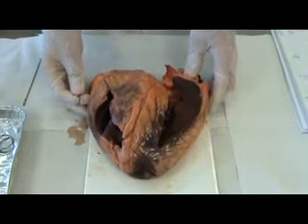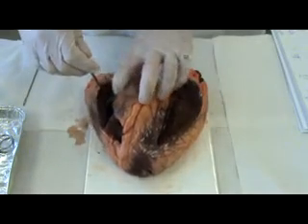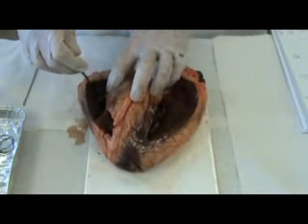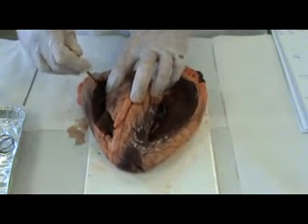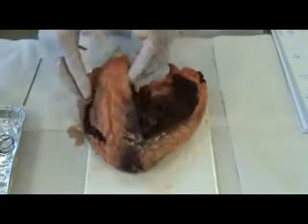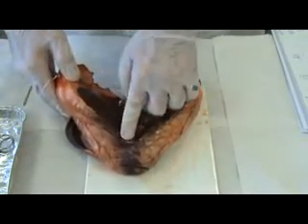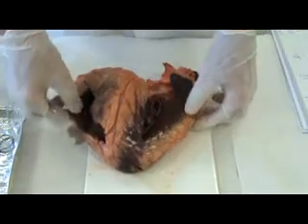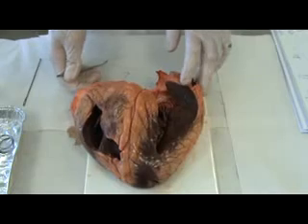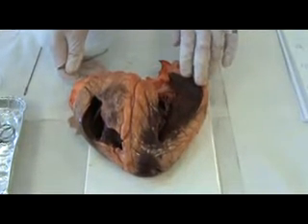And part of that coordination is provided by this electrical supply to the heart, the sinoatrial node, which can be found in the posterior area, the back part of the right atrium. It supplies electricity to the heart, which runs down the interventricular septum all the way down to the apex and radiates outwards. So the electricity, the nervous impulse, is allowing the heart to beat in a coordinated fashion.